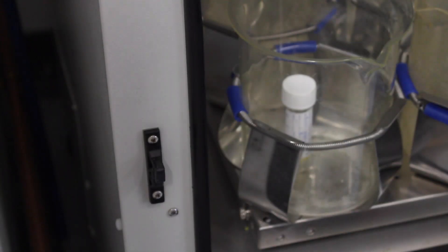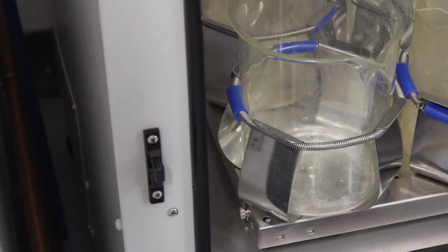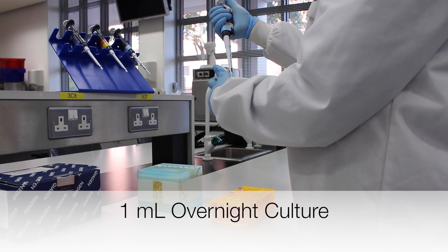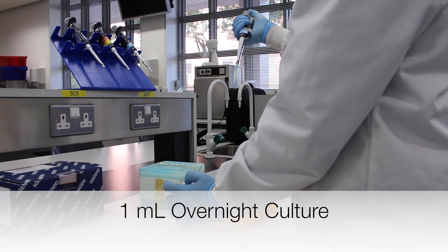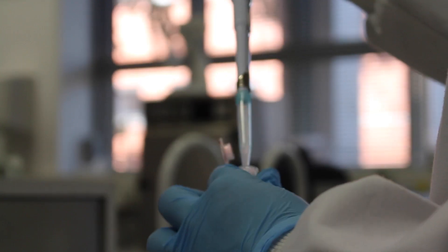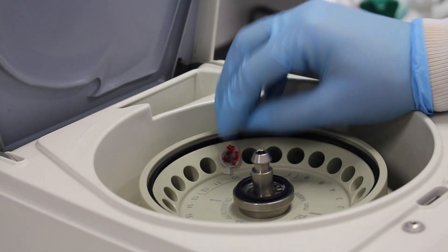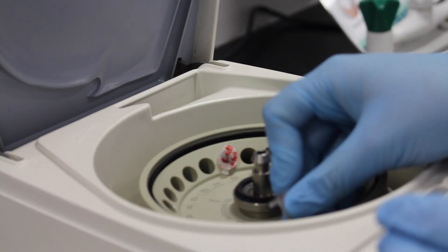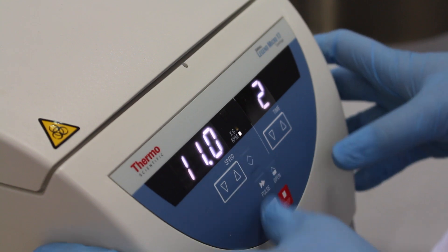An overnight culture of bacteria is removed from the incubator. One milliliter of this overnight culture is transferred into two properly labeled Eppendorf tubes. These tubes are placed into a centrifuge and centrifuged at 11,000 RPM for 2 minutes.